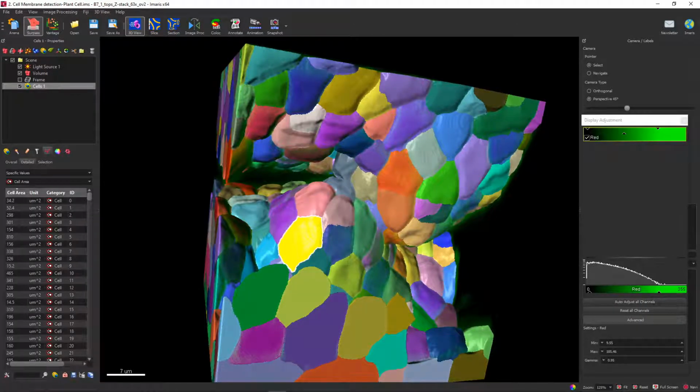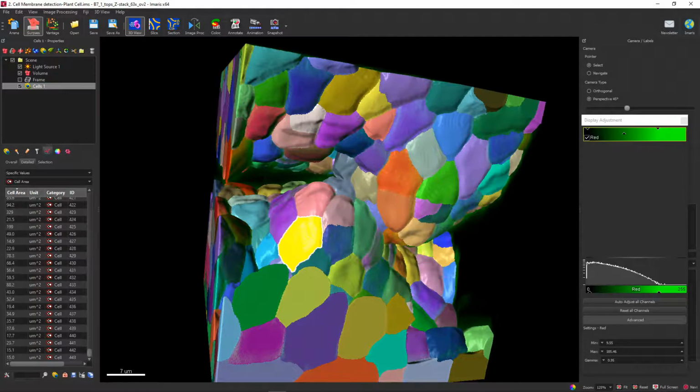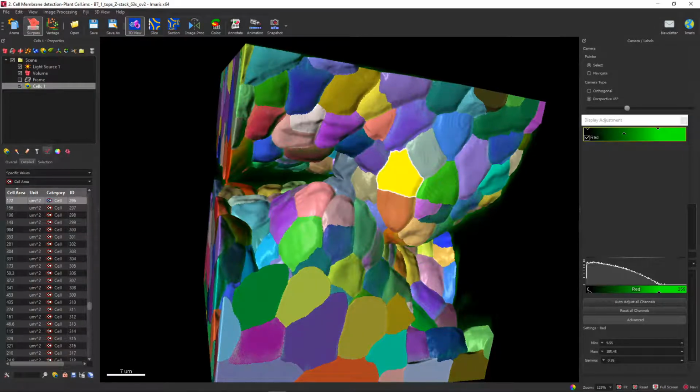When I look into the detailed view, I have a list of all the statistics for all the cells. And again, once I highlight some, it will point me to the table. Of course, this data can be exported to Excel and analyzed later.